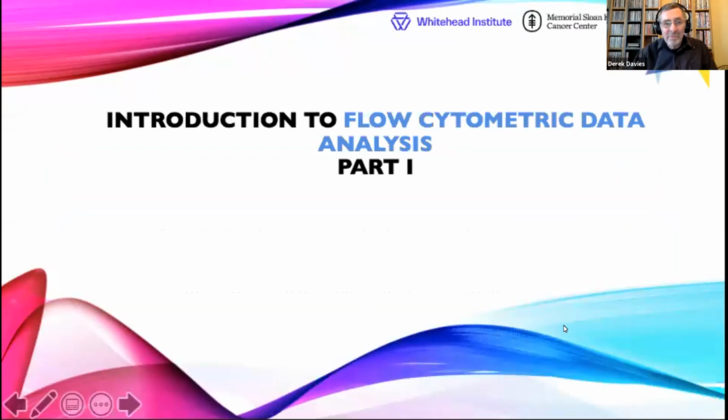Okay, so as I said, we're going to talk about data analysis today. And in our previous webinars, we've covered a lot of the practical aspects of flow cytometry. So we've looked at QC, we've looked at setting voltages, we've looked at compensation. We've also looked at full spectrum analysis and cell sorting.